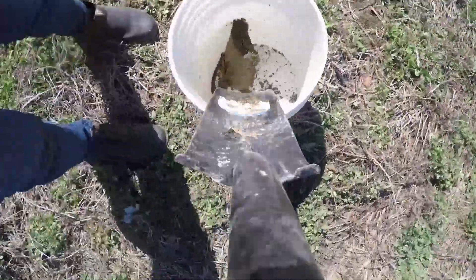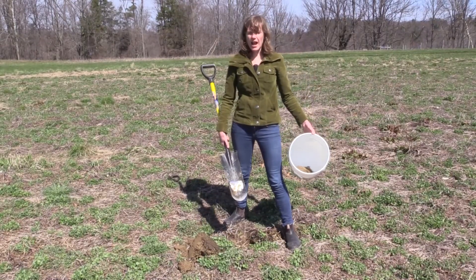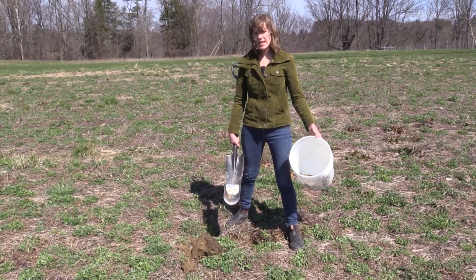And then it goes in the bucket. This is sample one. From there we can move on and take the other samples.